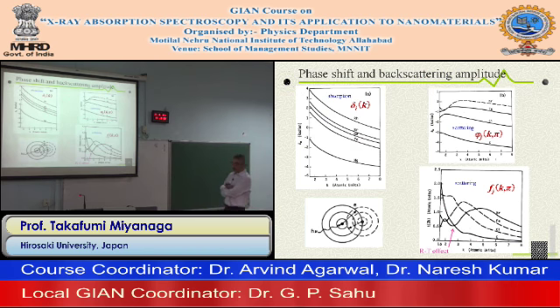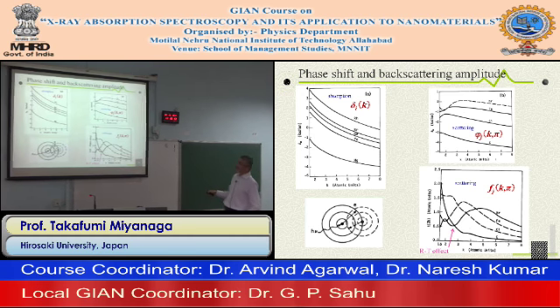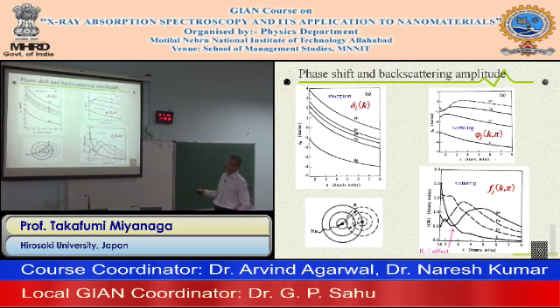Now we check the rough functions of the phase shift and the back scattering amplitude. Here is taken from Teo's text, a very old text, but very useful.